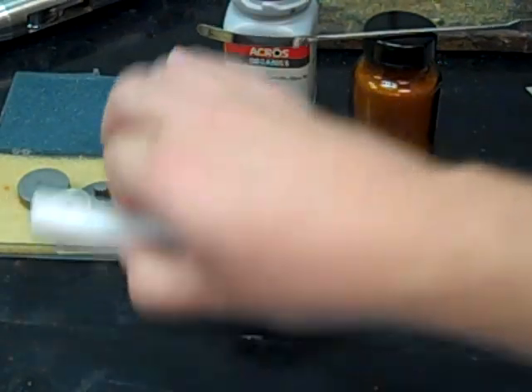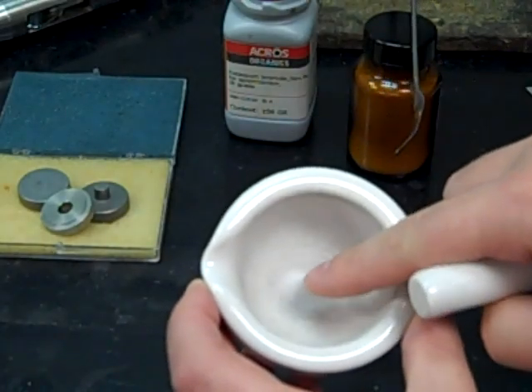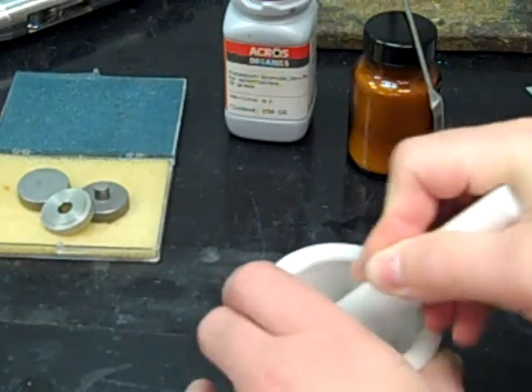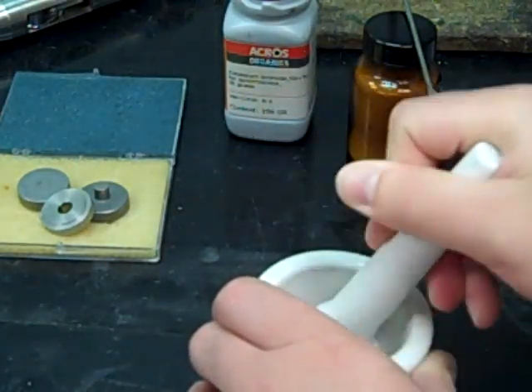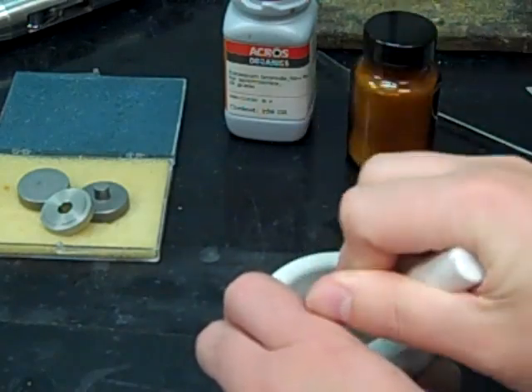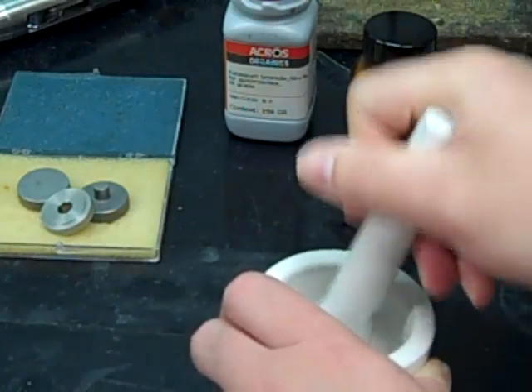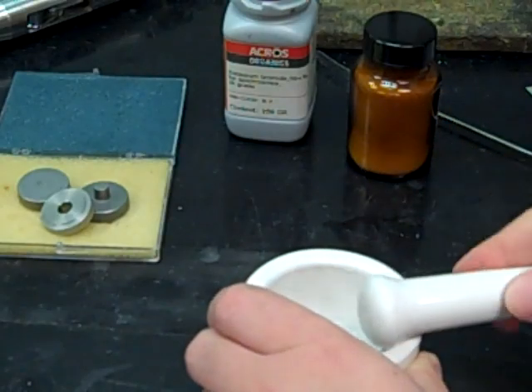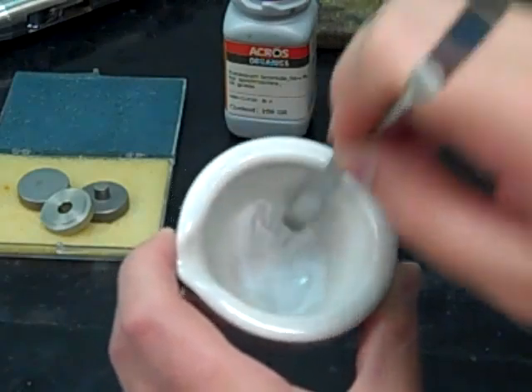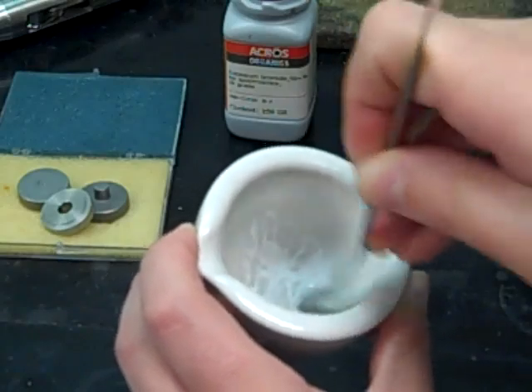Once you've gotten your sample in there, and you can see it's not very much at all, just barely down there in the bottom, you're going to grind that up until it's as homogeneous as you can get it. So work it around in different directions, push it off the walls if you need to. When you're finished, you should have enough solid to give you a few attempts at actually pressing this solid into a pellet. You can see it's kind of spread out there, and you can use your spatula to scrape that all down to the center.